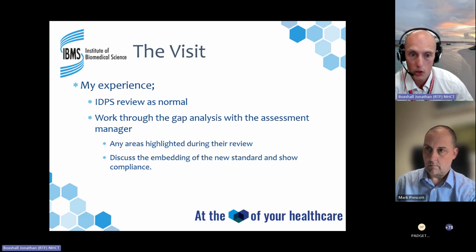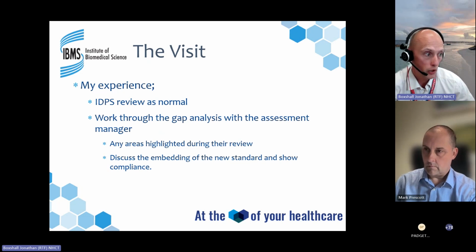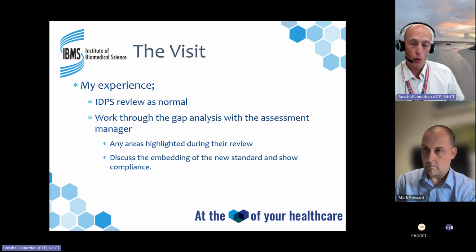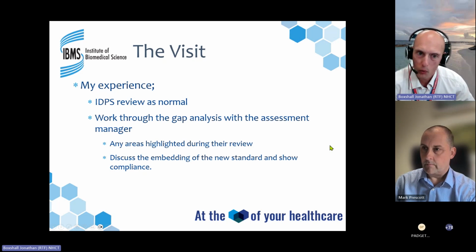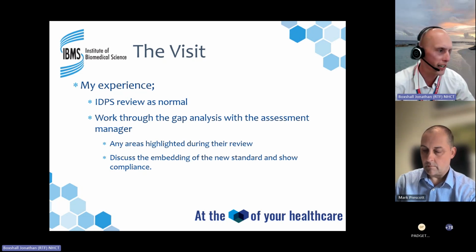highlighting, pulling documents up out of QPulse, which is our quality management system, discussing the embedding of the new standard and showing compliance. And the key thing is about being able to have these documents at hand quite quickly so that we don't waste time looking for things. So when they're asking to see something, I knew where it was and it was there. And I use QPulse now, where you can do relating standards. I don't know if people out there use QPulse in that way, but you can build the entire standard into QPulse and then relate every single document to any standard you want, and that's very handy.